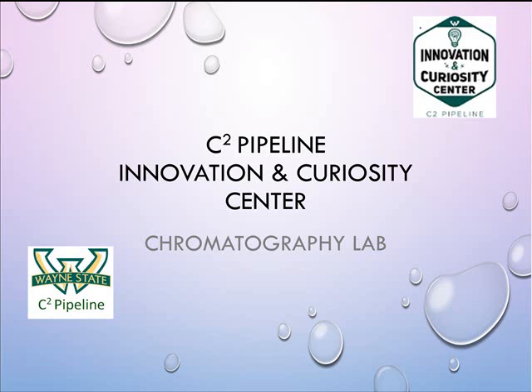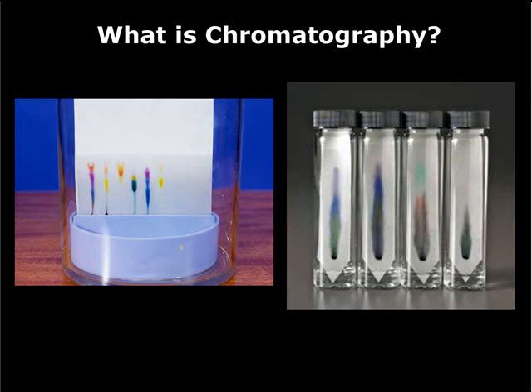Welcome to the C2 Pipeline Innovation and Curiosity Center Chromatography Lab. Chromatography is a word derived from the Greek word chroma, meaning color. Chromatography provides a way to identify unknown compounds and separate mixtures.